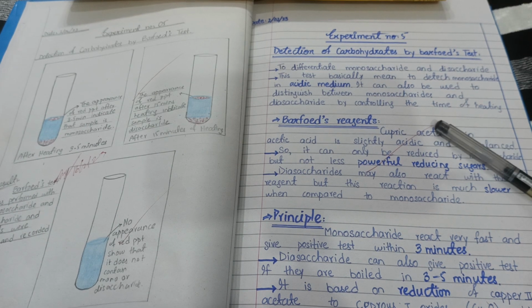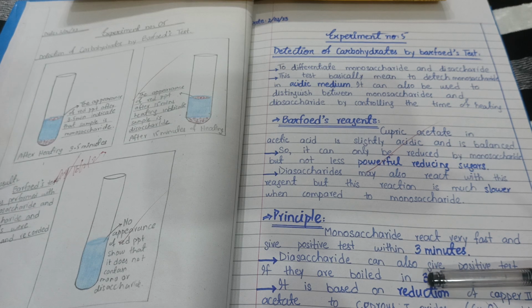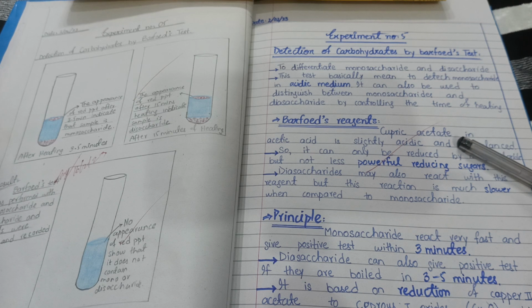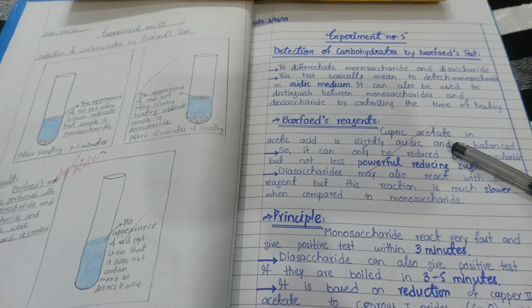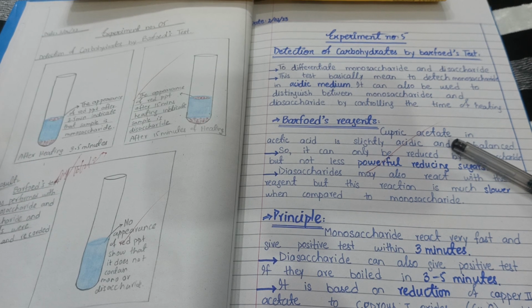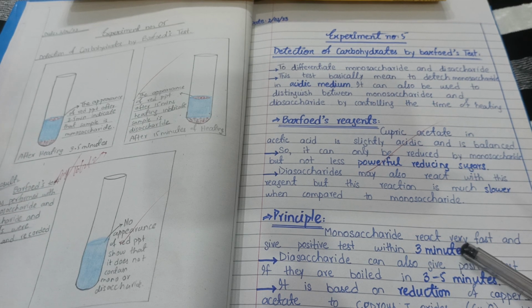And after that you need the Barfoed reagent for this, and you have to add the principle for this. Now what is the Barfoed reagent? Actually it is a cupric acetate ion which converts or reduces into the cuprous ion. Okay, your cupric ion is going to change into cuprous. So this is the reduction reaction. And now we see what is the principle of it.